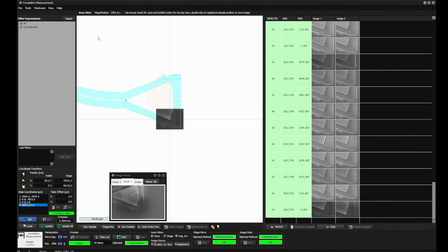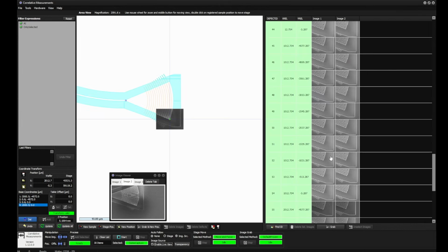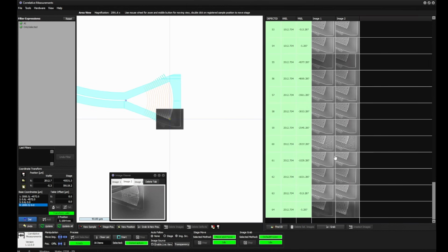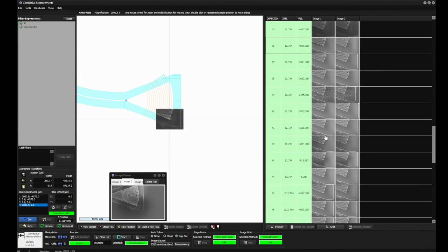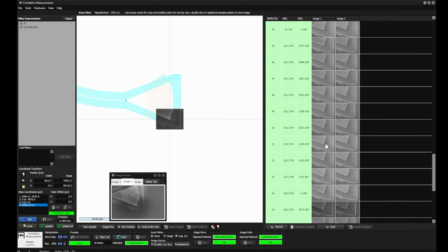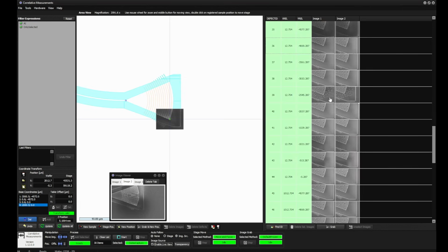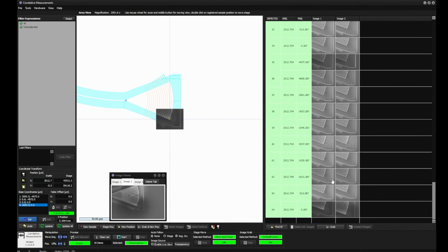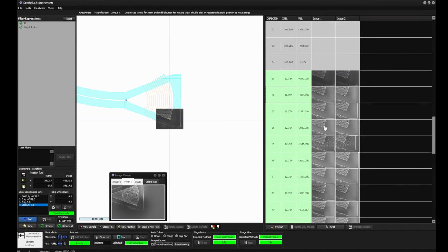We are finished with a double refine procedure, and you can see that the left side of the two images, or the left column, has very high precision. You can even see now that the center part is still at the same place, and the dimensions of this feature itself change.